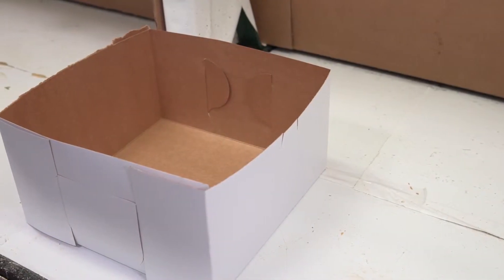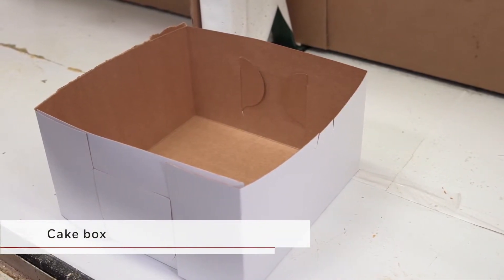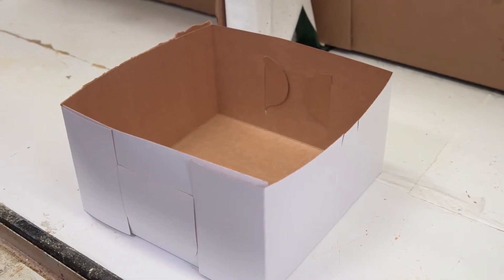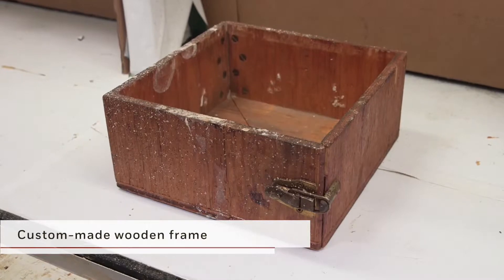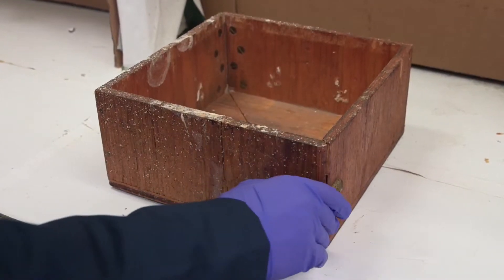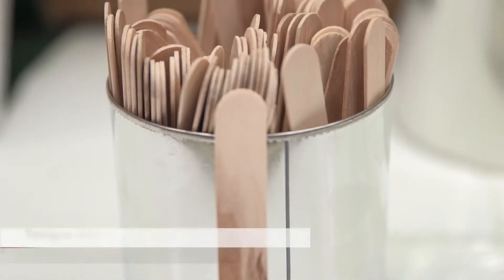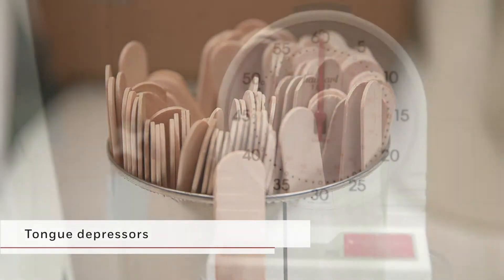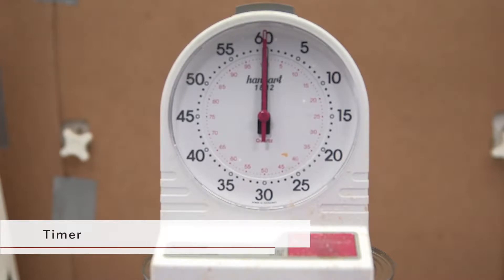The mixed foam will be poured into what is commonly referred to as a cake box to expand. The cake box is made of uncoated cardboard, and its size depends on the testing to be done. The cake box is placed inside a custom-made wooden frame to provide rigidity during polyurethane foam expansion. The wooden frame is equipped with a hinge that opens to ease removal. Tongue depressors will be used to test the reactivity properties of the hand-mix foam. A timer will be used to ensure that pouring and mixing are performed for the correct duration.